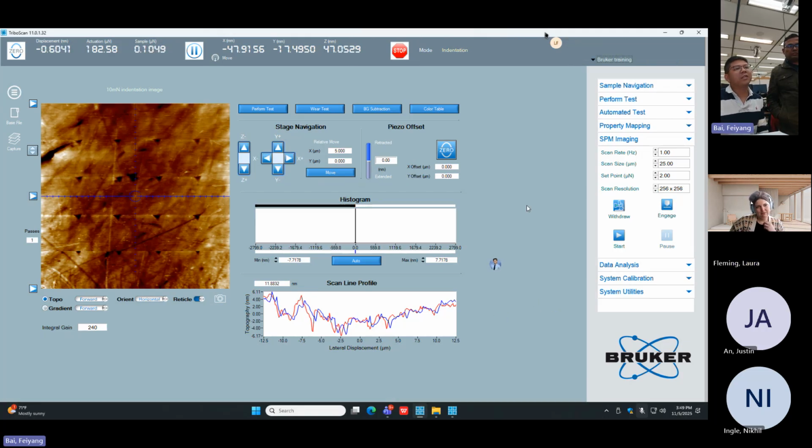So that's why earlier we did some mapping. If you recall, the first day I asked why it keeps going. I thought when it's finished, it should disengage itself or give a cue saying it's finished. And also, for this one, we used the background subtraction, because at the beginning it's all white, and after going a couple of times there will be something on it.